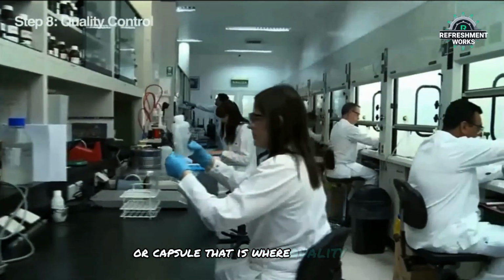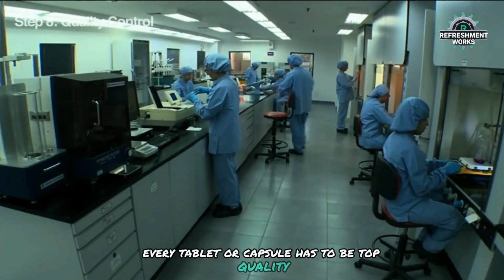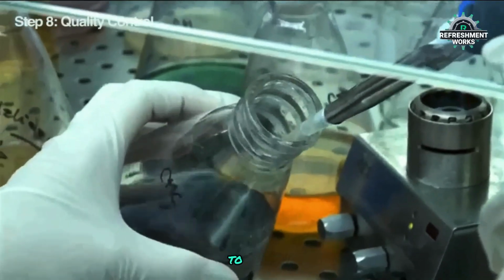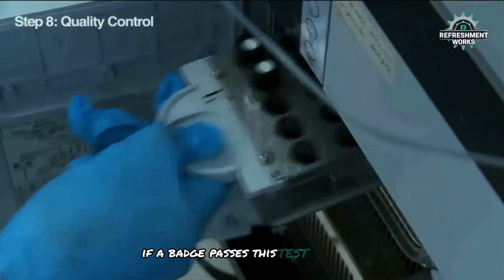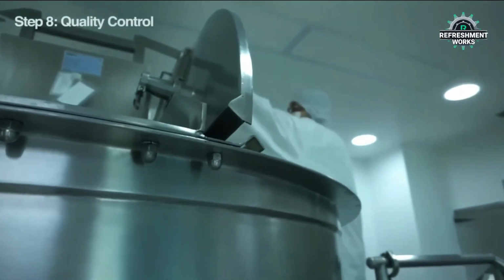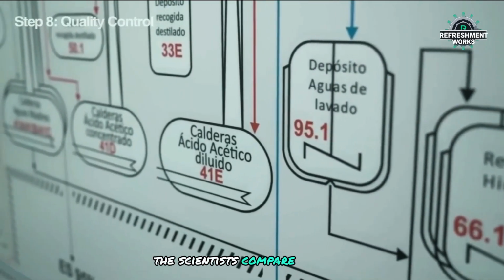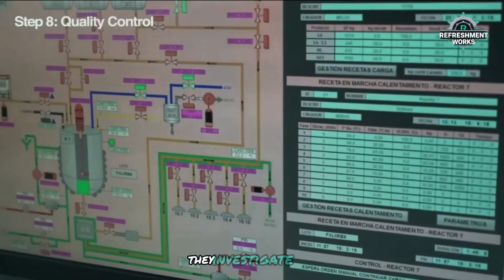That is where quality control comes in. Every tablet or capsule has to be top quality. So throughout the production process, scientists take little aspirin samples. At different stages, they test these samples to measure the exact concentration of aspirin in each one. If a batch passes this test with flying colors, it gets the green light for becoming tablets or capsules. But they also do random checks on each batch, just to be extra sure every single one has the correct dose. The scientists compare the results to super strict standards, and if anything falls outside those lines, they investigate further.